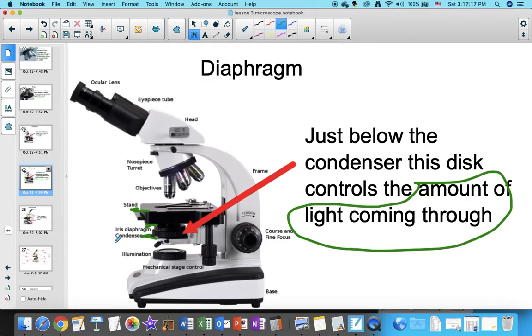If you stand in a very bright room, your pupils might get smaller because your irises are making your pupils smaller so that you don't collect that much light, so that you don't go blind, you know? If you don't have that ability and you walk into a bright room, everything might seem too bright. You might not be able to see anything. Well, the same is true with a microscope. If you open the diaphragm too wide and there's too much light coming through, the object might just disappear in the light. So you may need to make the hole smaller on the stage. So you turn the diaphragm.